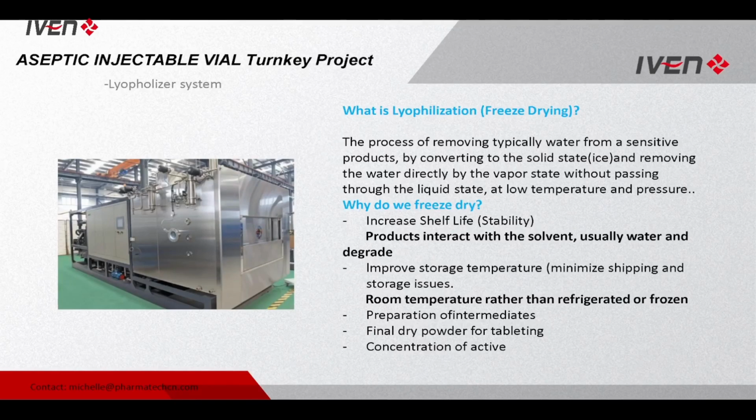Firstly, it can increase the shelf life. Secondly, it can improve the storage temperature. Like some products, if in liquid form, may need storage in cold storage, but when in solid form, they can just be kept at room temperature. And also, it prepares the final dry powder for some tablets.